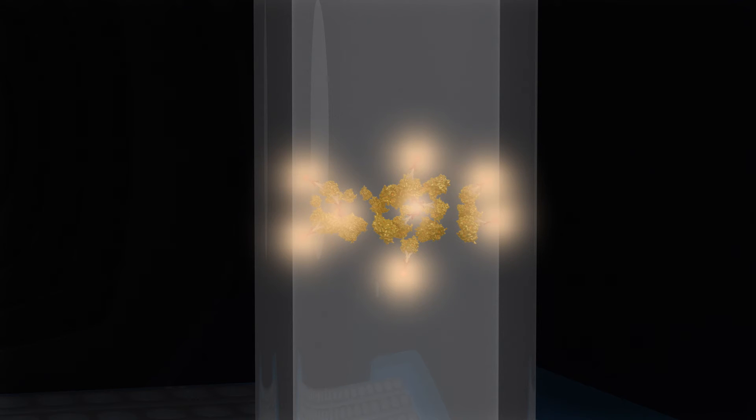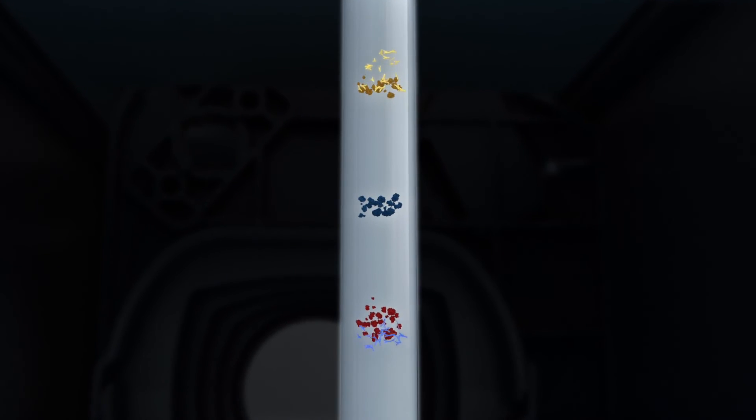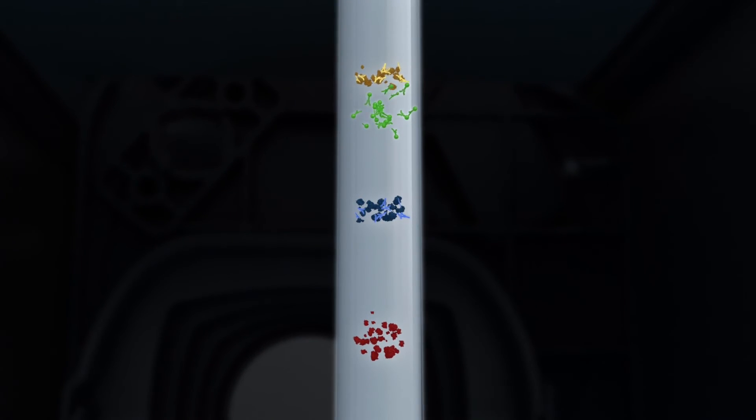This is followed by a chemiluminescent substrate, and the chemiluminescent reaction is recorded by a CCD camera in a series of images over time. For fluorescent detection, samples are incubated with the primary antibody, followed by infrared or near-infrared fluorescent secondary tagged antibodies. Excitation of the fluorophores releases photons, and the emission spectra is detected and recorded by a CCD camera in a series of images over time.